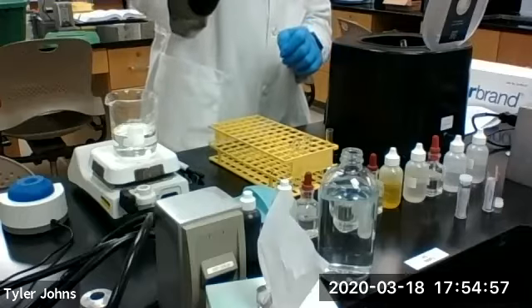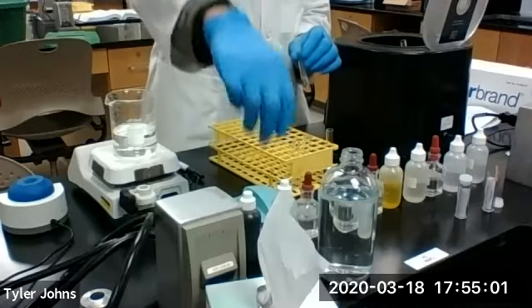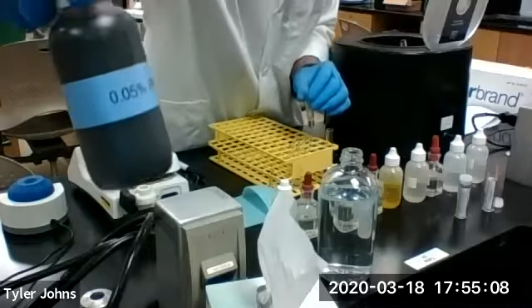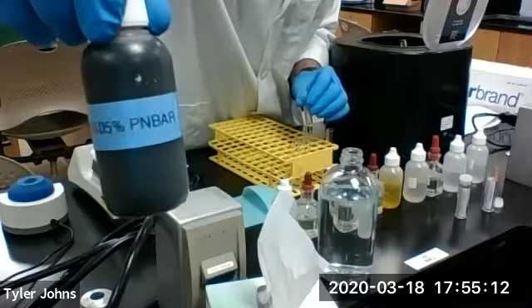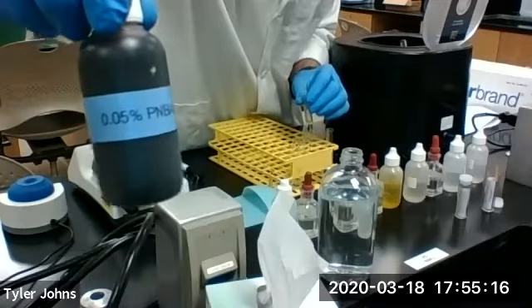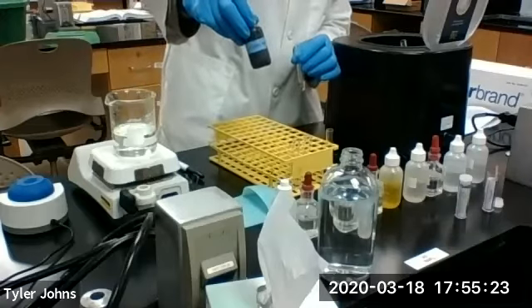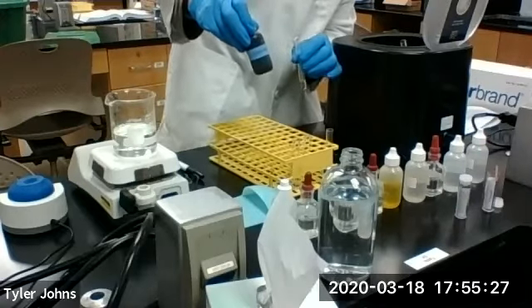But first, we're going to add 1 drop of magnesium reagent, which is PN bar for short. This is our magnesium reagent. I'll give one attempt at trying to pronounce that, and it is p-nitrobenzene azoresorcinol.